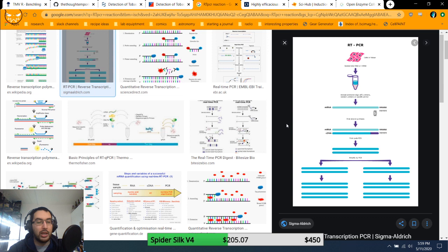So what you've got to do is process this out. Normally there's two ways of dealing with this. Either A, you get very expensive equipment: special tips and tubes and everything that's guaranteed RNase-free. You've got to get water that's been treated with, I believe it's called DEPC, and don't quote me on that because I'm going off memory here. That destroys the RNase, but by the time you go to use that water, it's broken down, so it's safe and it won't wreck the rest of your reagents.